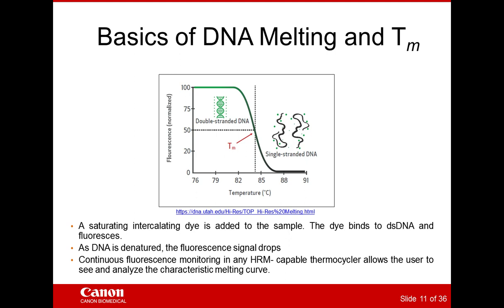To touch a little bit on the basics of high-resolution melting, as I had mentioned, it is a standard endpoint PCR followed by a melt at the end, so to melt the product. What we use is an intercalating dye. So the dye is not attached to a probe, unlike some of the hydrolysis probe methods that we had touched on. So it's non-target specific. It's an intercalating dye. It sits in between double-stranded DNA.